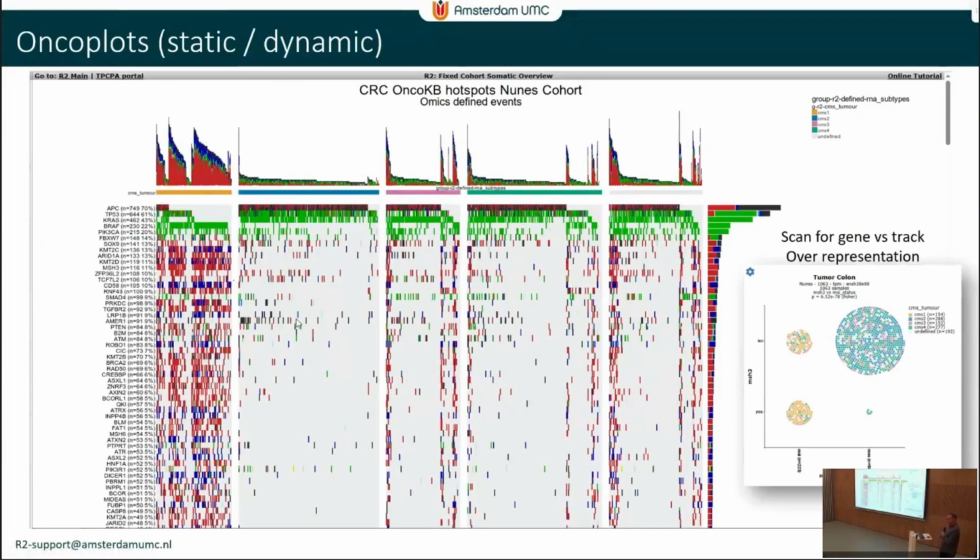It goes a bit far, but you can do nearly infinite combination possibilities here: I want to include only genes with this particular overexpression, only those copy number states, only those genes, and in that way you can really define a particular cohort and identify something that can be quite interesting.